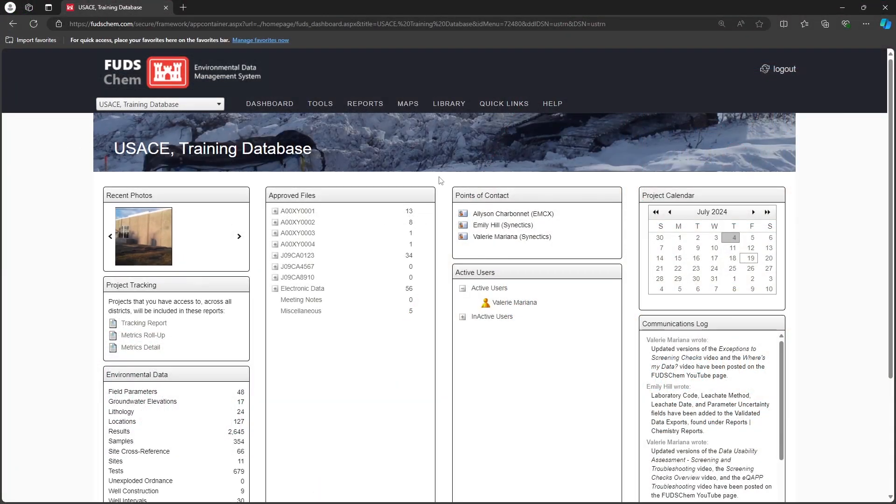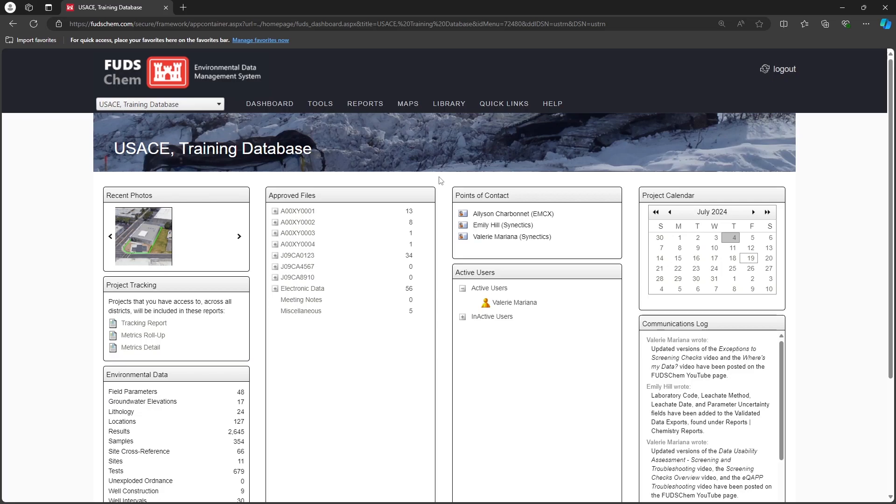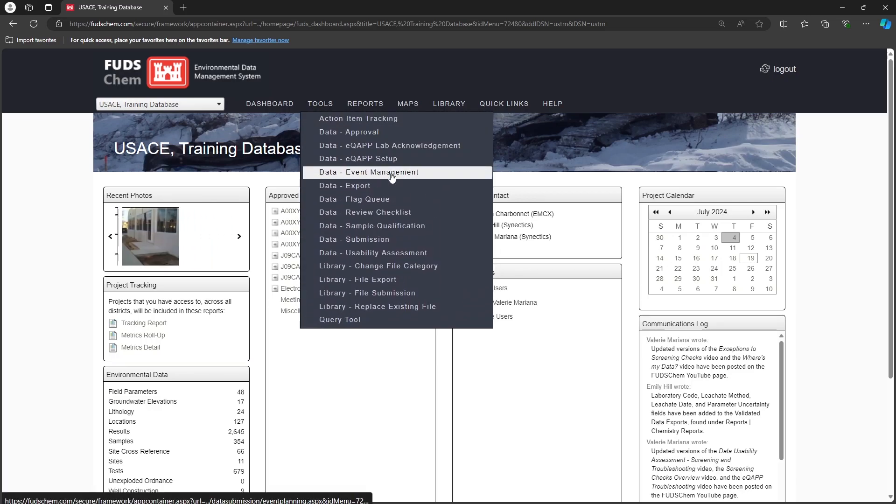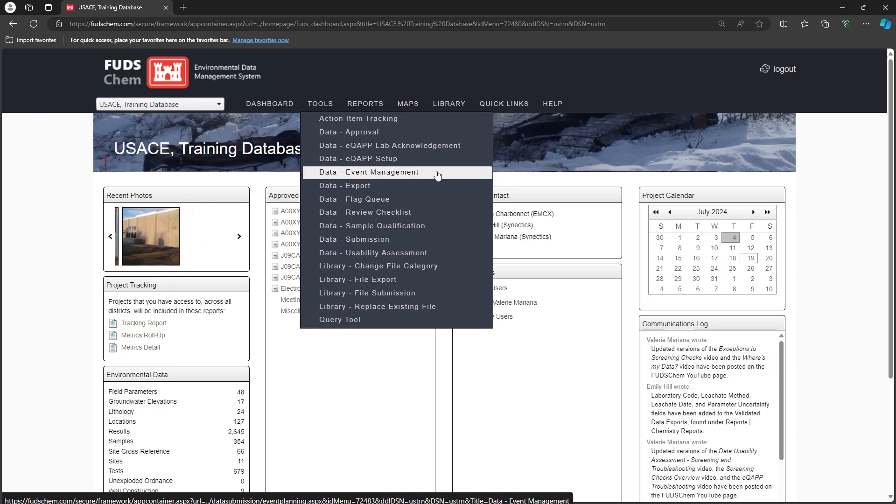Before entering a CHEM field file, we recommend entering your event planning information, even if sampling has already ended. Doing so will pre-populate several fields in your CHEM field files and ensure that FUDsChem's event tracking reports will run.